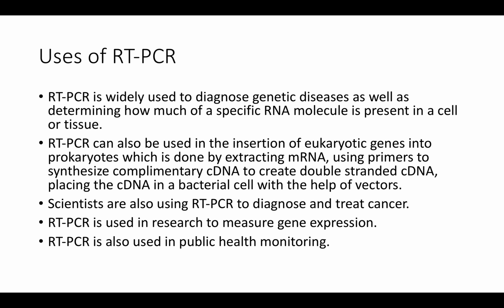Scientists are also using RT-PCR to diagnose and treat cancer. RT-PCR is used in research to measure gene expression and is also used in public health monitoring.